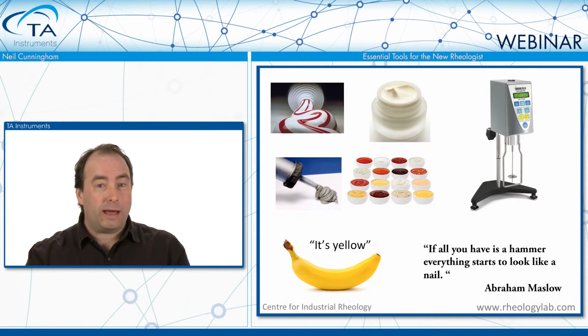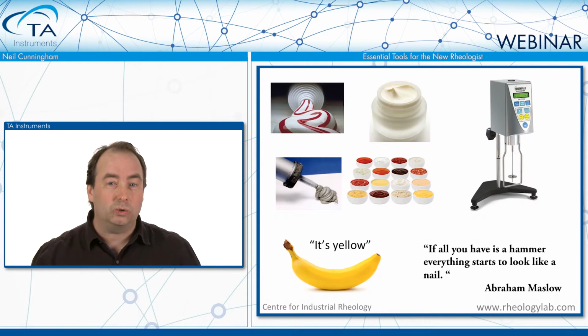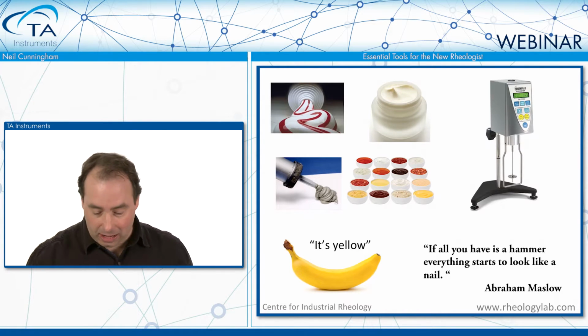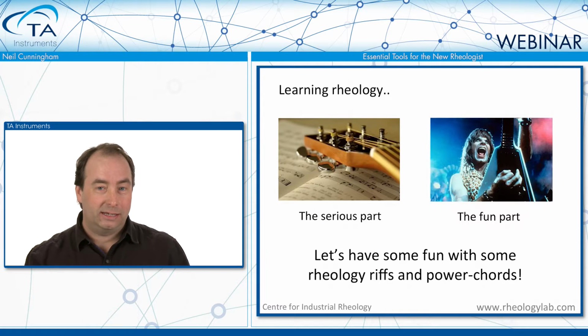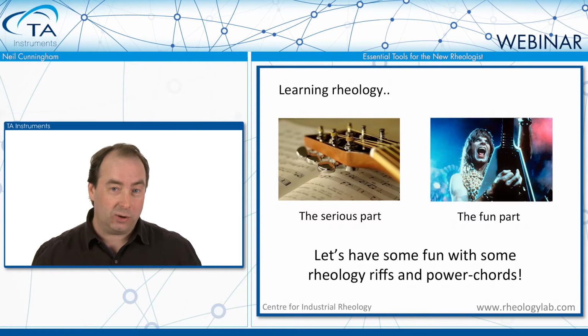So we need to learn a little bit about rheology, and what I'd like to do is show you a few basic tools and techniques. I like to think that learning rheology is a lot like learning to play a musical instrument. The fundamentals and the theory are absolutely essential if you want to become a virtuoso.